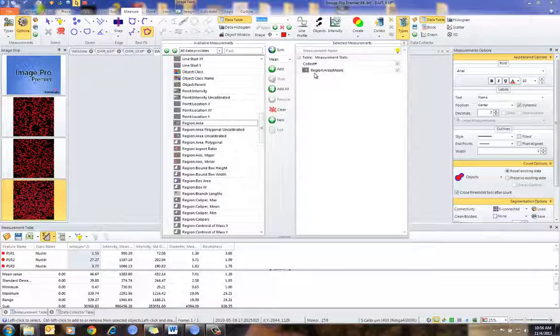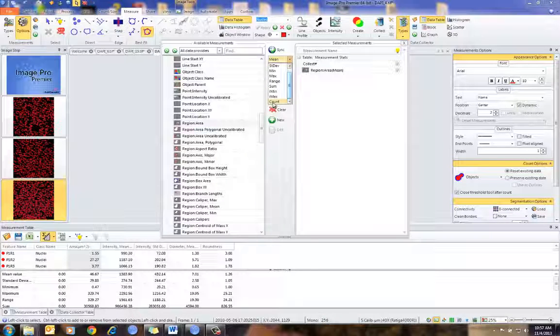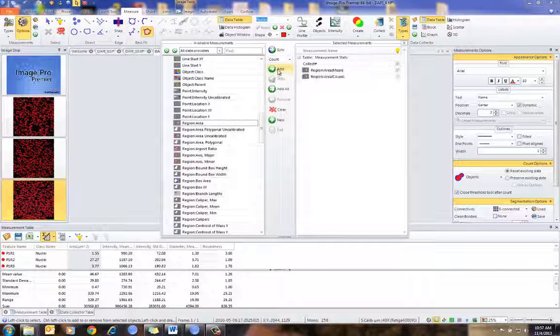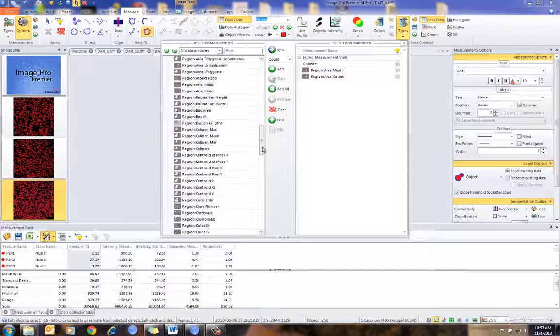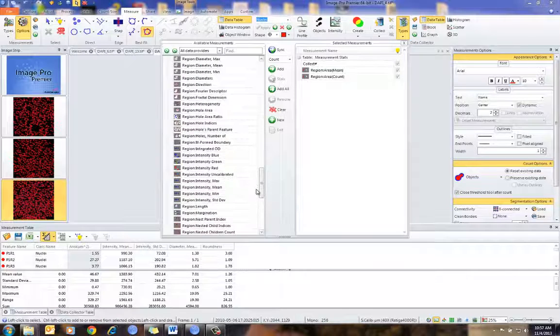There's a wide variety of data inputs I can select here. Maybe I want the count of all the objects per image — in this case I can select count, add that, and you'll notice it's listed as region area mean and region area count. So this will give me the number of nuclei per image.